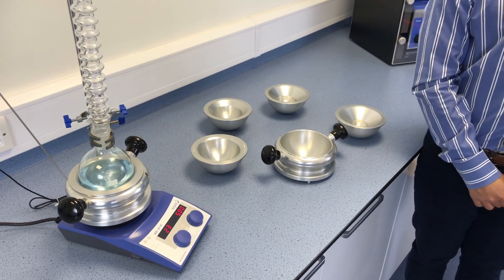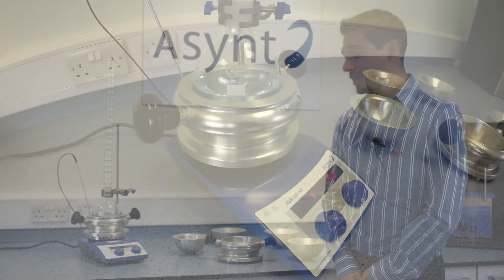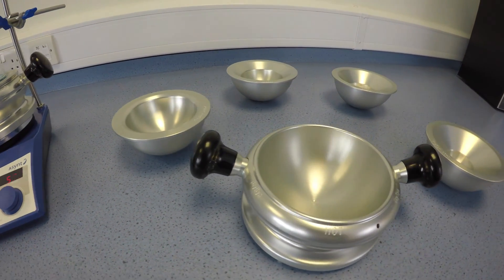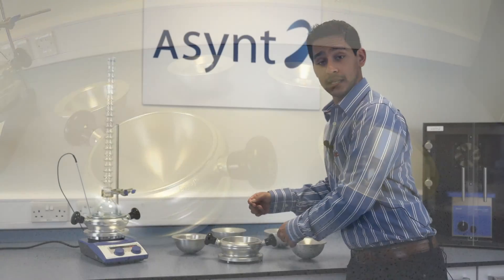The DrySyn Classic is the original Asynt product. It was designed to eliminate oil baths from the lab and provide a safe and flexible alternative.